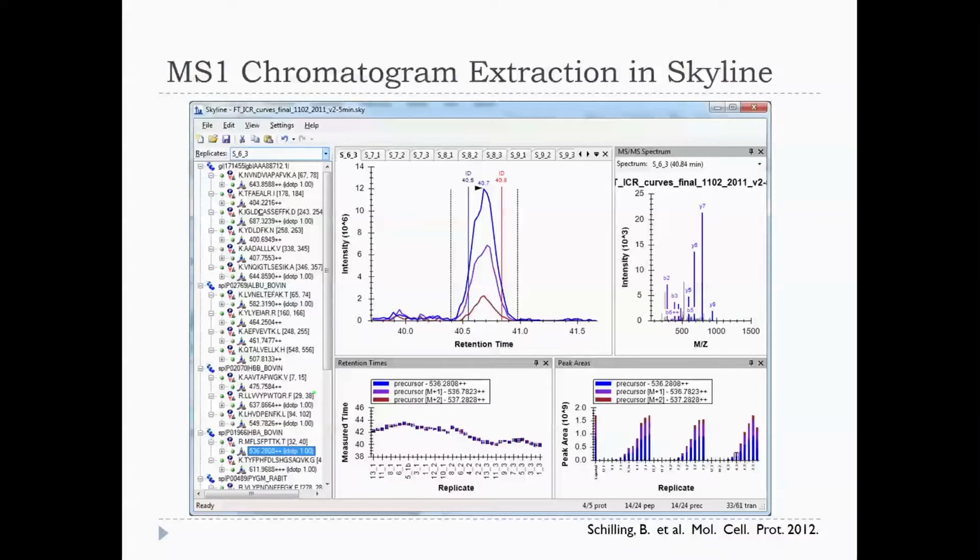If this is ordered in acquired time, how did that person choose to do this dilution curve? They did it in 3 cycles. So when we joined CPTAC, they were doing their dilution series as like 1, 2, 3, 1, 2, 3, 1, 2, 3.